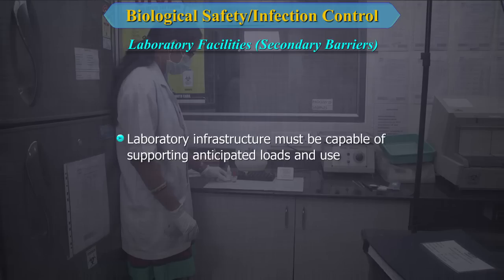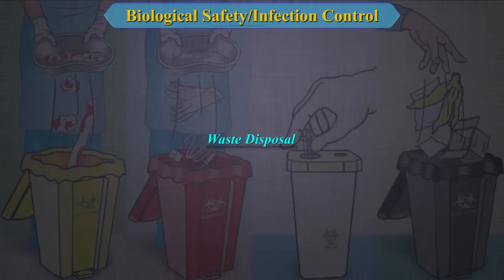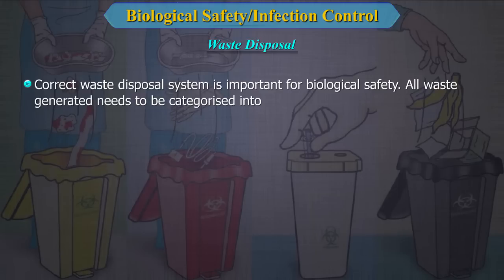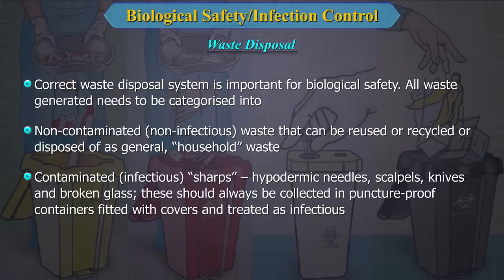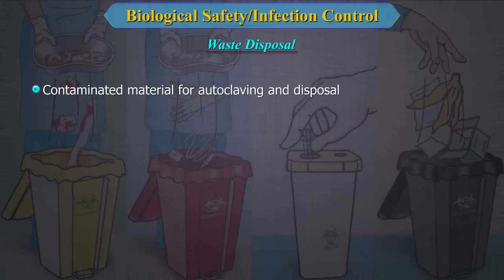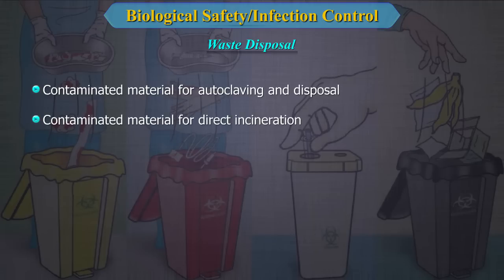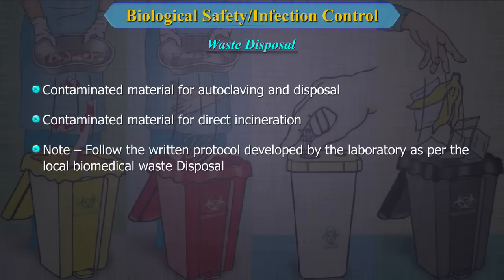Waste disposal is a very important item. A correct waste disposal system is important for biological safety. All waste must be categorized into: 1. Non-contaminated, non-infectious waste that can be reused, recycled or disposed of as general household waste. 2. Contaminated or infectious sharps — hypodermic needles, scalpels, knives and broken glass — collected in puncture-proof containers and treated as infectious. 3. Contaminated material for autoclaving and disposal. 4. Contaminated material for direct incineration. You must follow the written protocol developed by the laboratory per local biomedical waste disposal regulations.